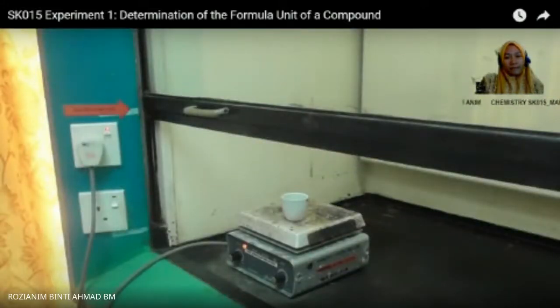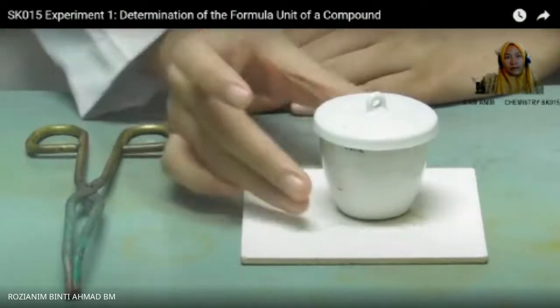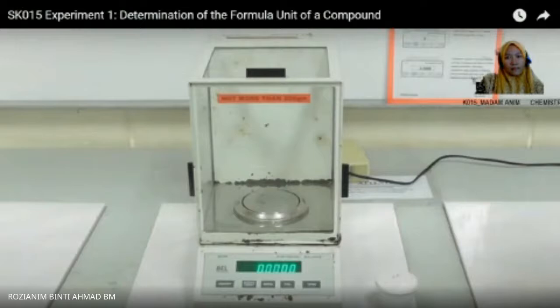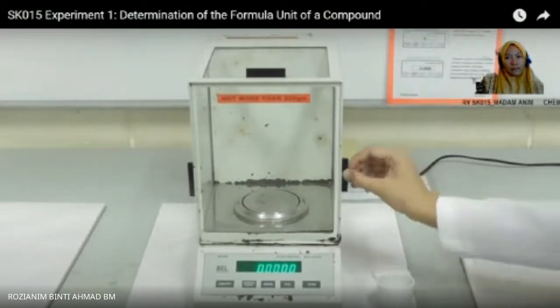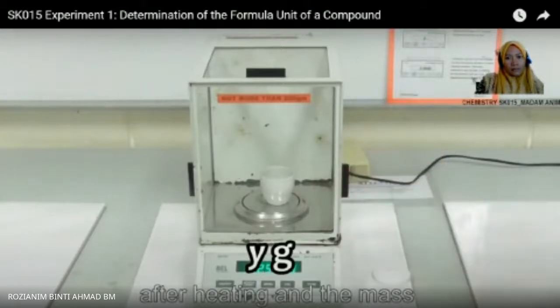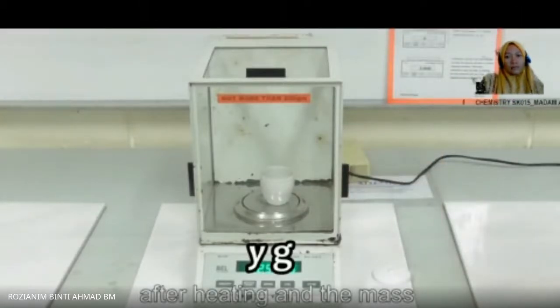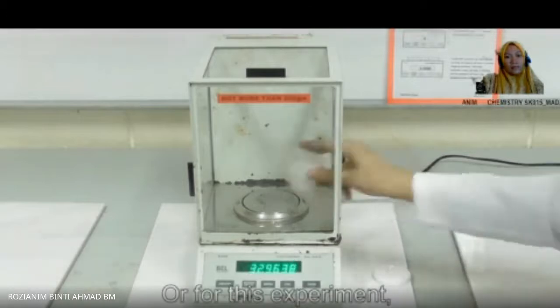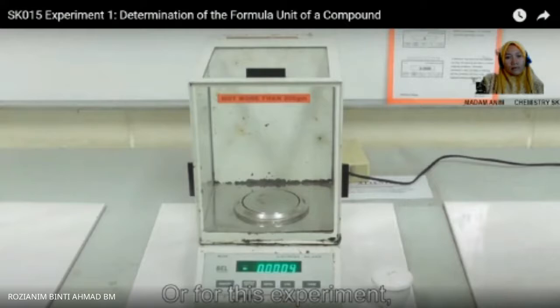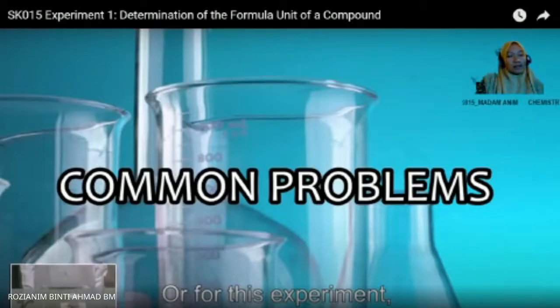Repeat the heating and weigh process until the mass after heating and the mass after the next reheating is constant. Or for this experiment, 0.02 grams of error is acceptable. This part, dia target dia. So maksudnya dia nak, kalaulah difference data tersebut dapat 0.02, we can stop our experiment.